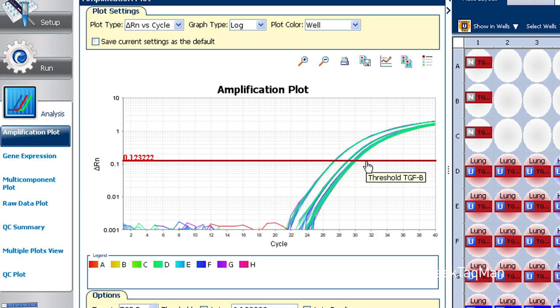Now, not all places on the y-axis are equal. Some regions we want to avoid. Specifically, we don't want to be too low, otherwise we get down into the noise. Conversely, if we go too high, we're in the linear or plateau phase of amplification, where data are less predictable.